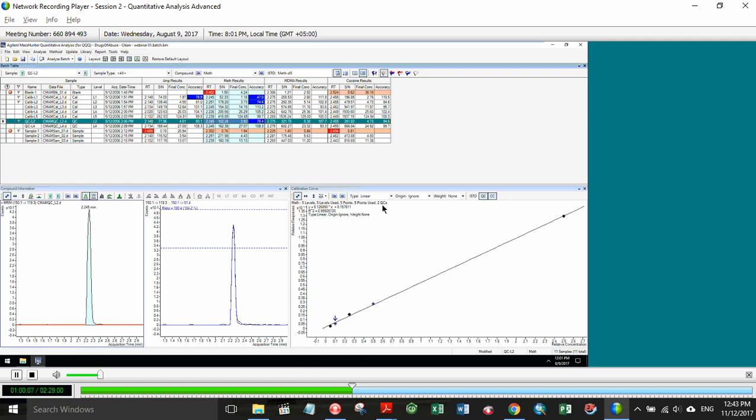Okay, and I think you may have mentioned this, but I'll ask it here. How is QC different from CC in calibration curve? QC and CCs have different applications or different definitions depending upon the application method that you're using. For example, in EPA methodology, a CC is a continuing cal. What we can do in the environmental type applications is generate a 5-point curve today, right? I'm doing GCMS.